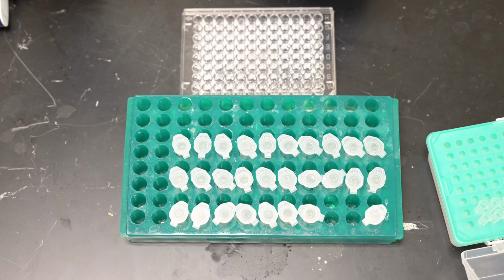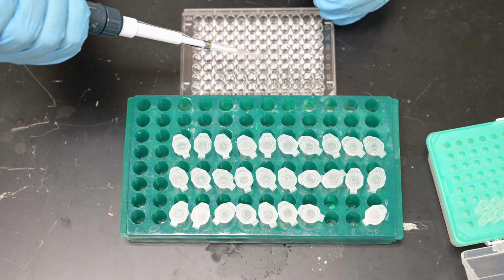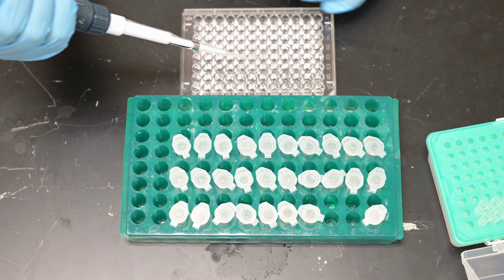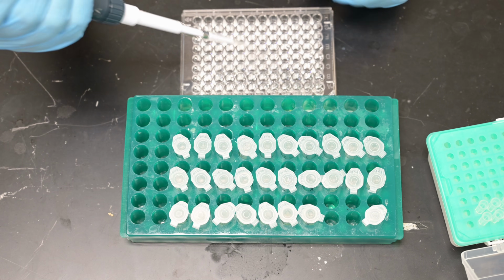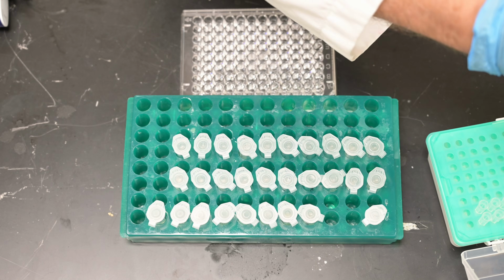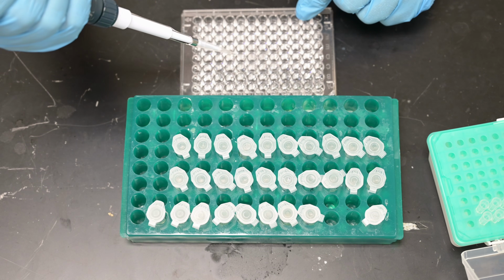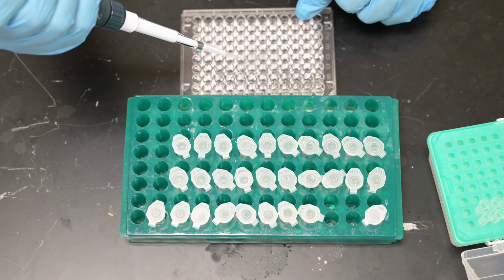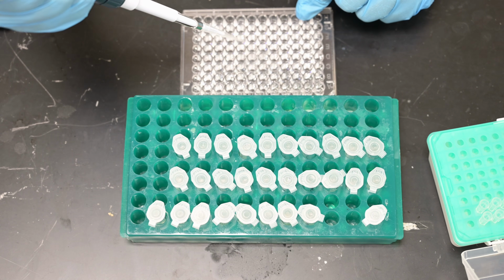And the last sample goes into D7, E7. And next I will go ahead and create a blank by putting water in D8 and E8.